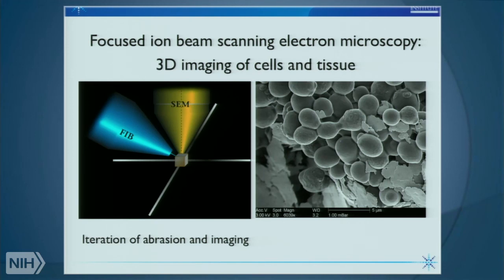And to get at this, I knew from the work in the semiconductor field that there were technologies based on focused ion beams that would let you cut into very large and certainly metallic or semiconductor objects. And in a collaboration with FEI company, which made these microscopes in the semiconductor world, we began to develop them for use in biology.